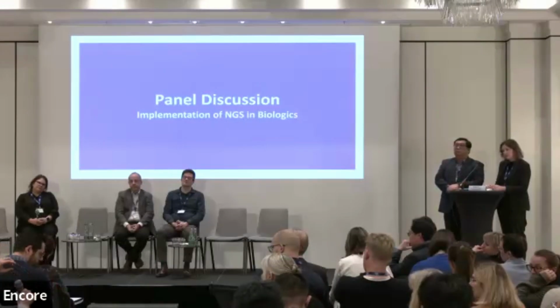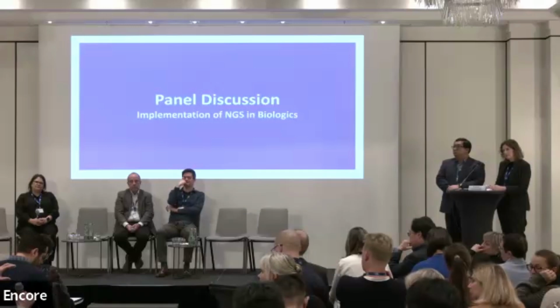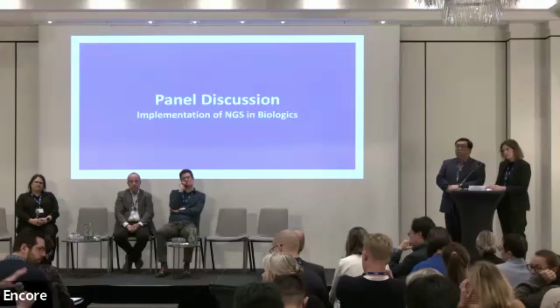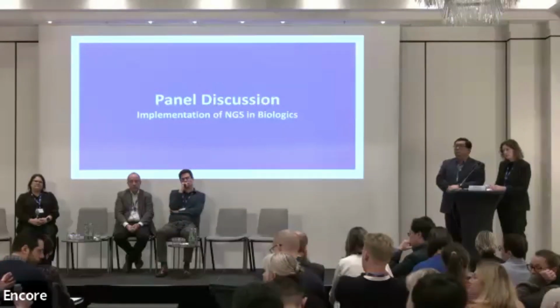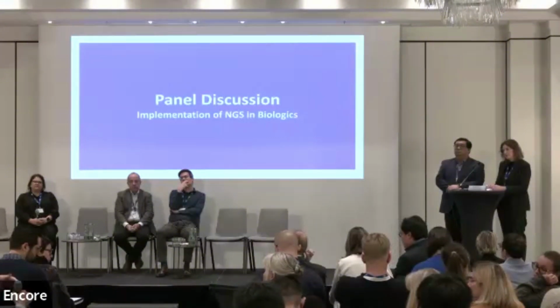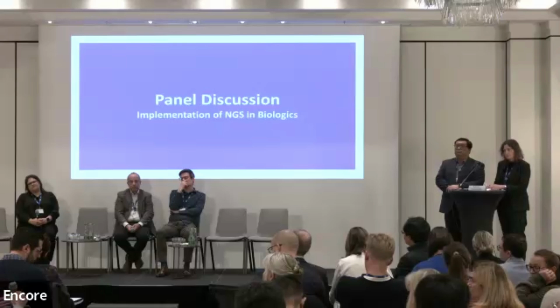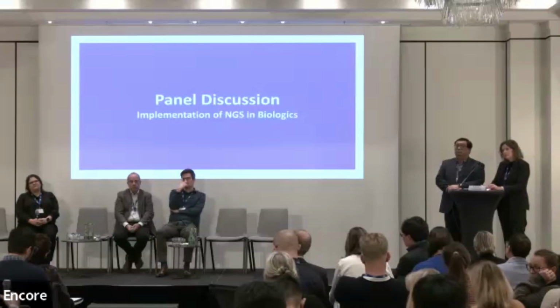For the experiments we did with and without benzonase, based on the preliminary result, the strain signal doesn't change when you compare the samples with and without benzonase. It's also clear that it is a remnant of retroviral sequence integrated in the genome, not an active one. So hopefully we can further develop the assay to detect the retroviruses.